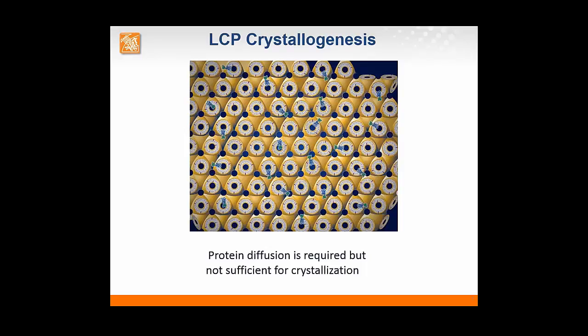As many of you know, lipidic cubic phase can be prepared from special lipids such as monoacylglycerol monoolein, by mixing it with about an equal amount of water. Upon mixing, the lipid will assemble into a lipid bilayer that resembles the environment of a biological membrane, and this lipid bilayer folds in three-dimensional space to form three-dimensional periodic structures with cubic symmetry known as lipidic cubic phase.